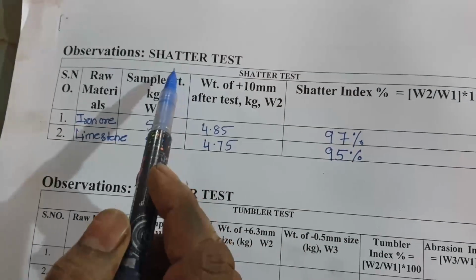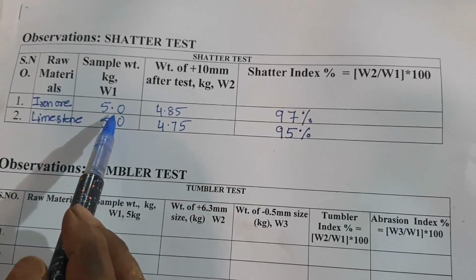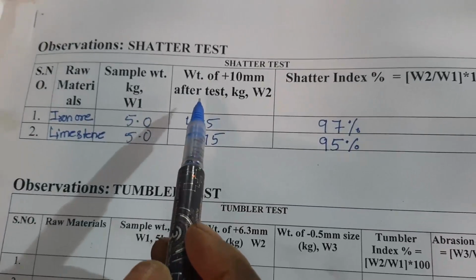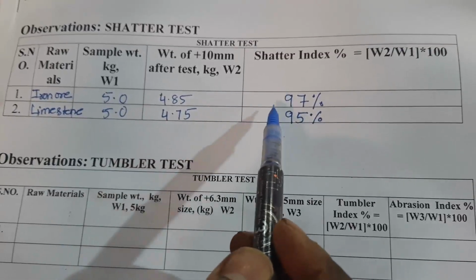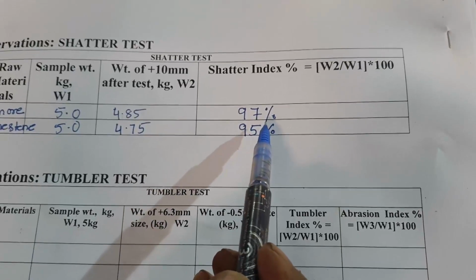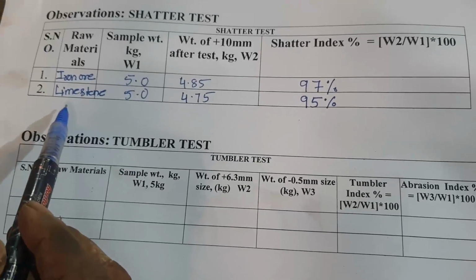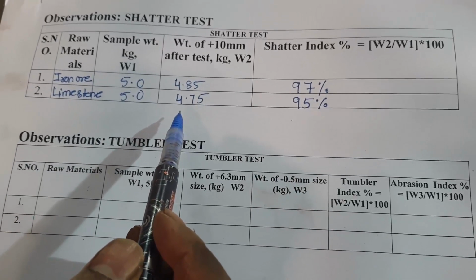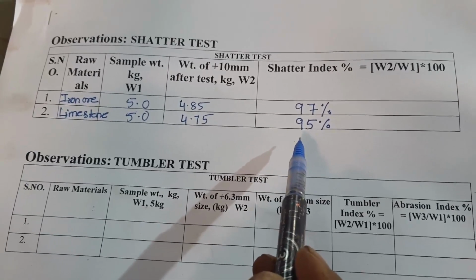Now we can see the shatter test observations. First is iron ore. Its initial weight we have taken is 5 kg. After the test, the weight of the plus 10 mm is 4.85 for iron ore. So finally we got the shatter index percentage. W2 by W1 into 100 means 97% we got. So the iron ore shatter index is 97%. In the same way we did for limestone also. Initial weight is 5 kg and after the test the plus 10 mm weight fraction is 4.75. The final shatter index percentage of limestone is 95%.